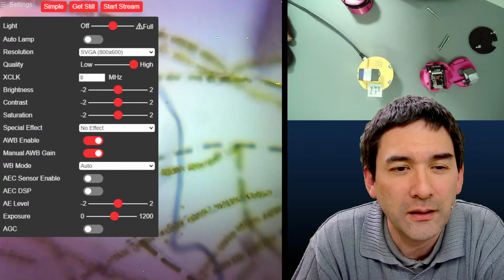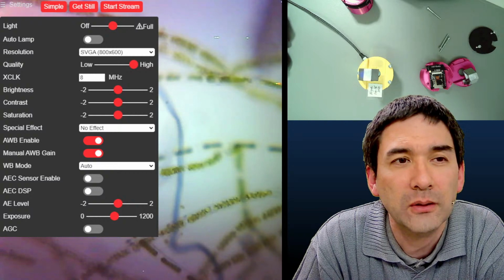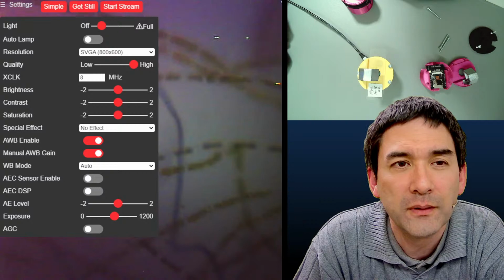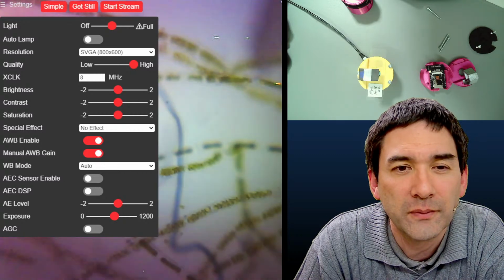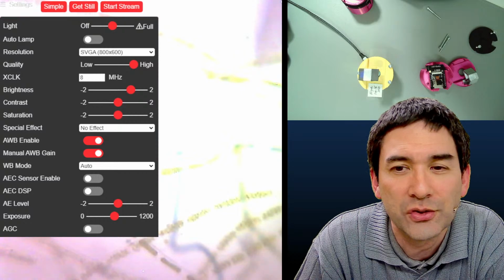There is something, and what I can do now is the following. I'm just going to demonstrate this to you now. Look at the top one at the light now. You can see that I'm using the mouse pointer. You cannot see the mouse pointer right now, but you can essentially adjust the light and brightness and contrast. I can also adjust that.